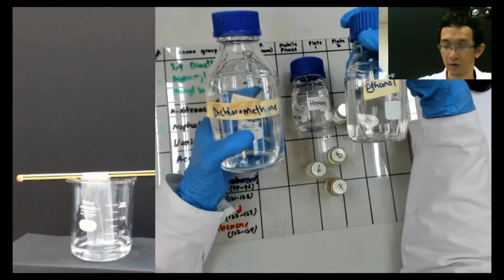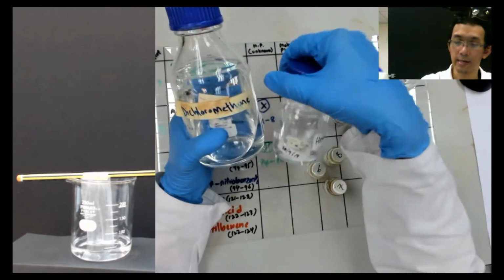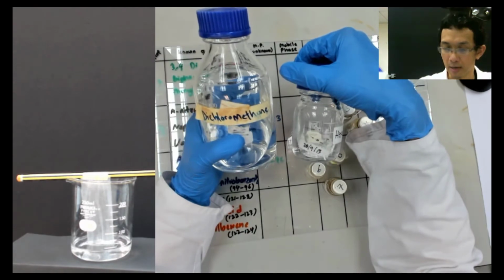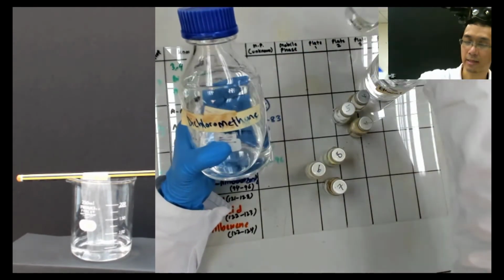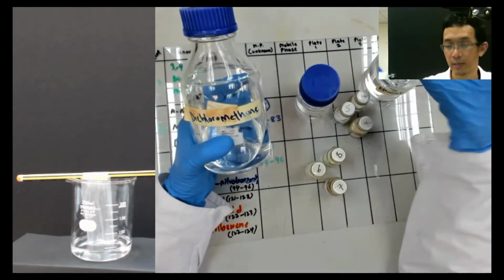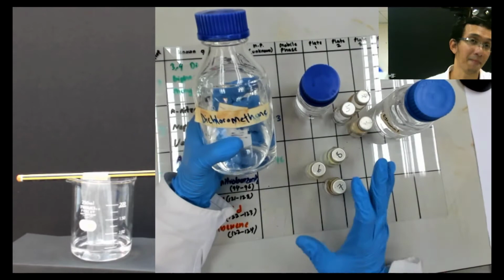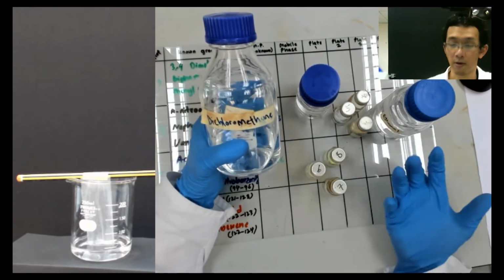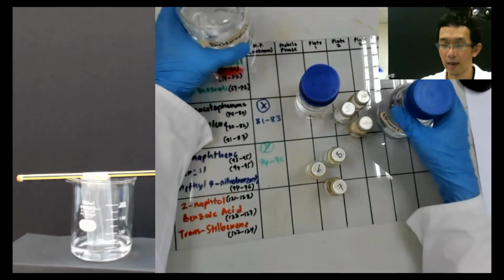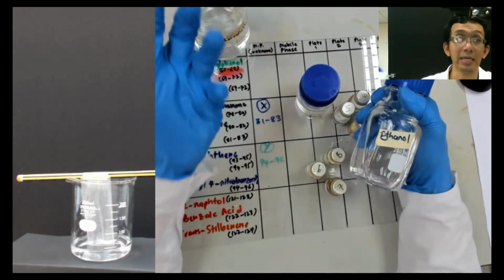Ethanol. Okay. So actually all of these can do that. But ethanol, you can dissolve all of this in ethanol, but maybe it will not fully dissolve, because remember ethanol has an OH group. Ethanol has an OH group, so it's more like water.